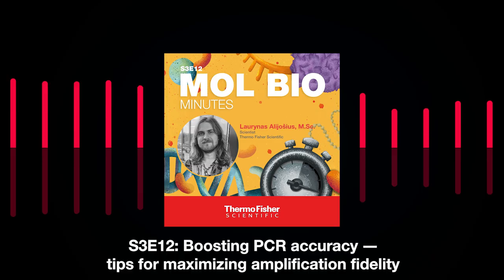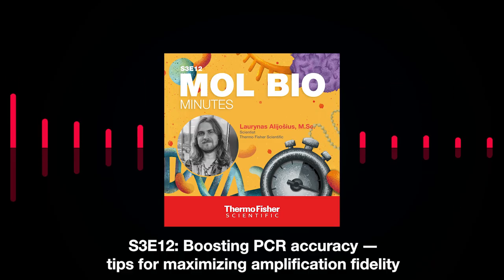PCR accuracy can also be impacted by other components of your PCR reaction.